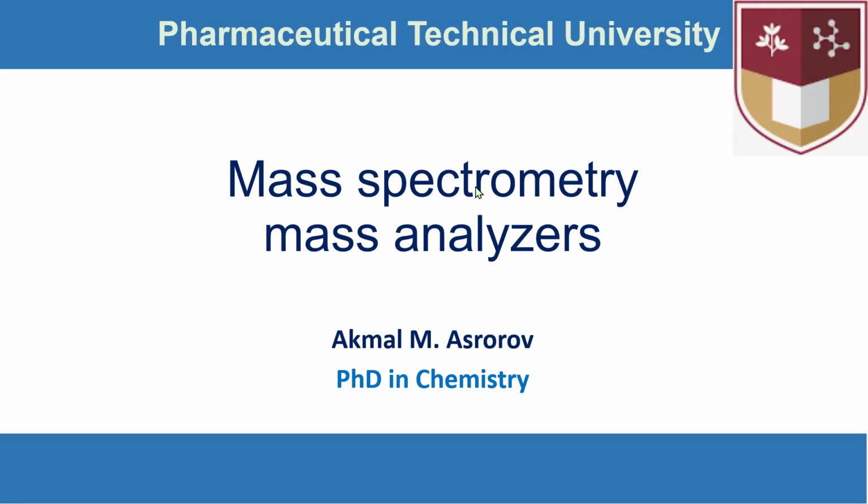Hello, this is the second part of our mass spectrometry lessons. In the first video lesson, we talked about mass spectrometers in general, and we talked about ionization sources. And in this video, we are going to talk about mass analysis. If you haven't watched the first video, I strongly recommend you to watch it so understanding this video can be easier for you.